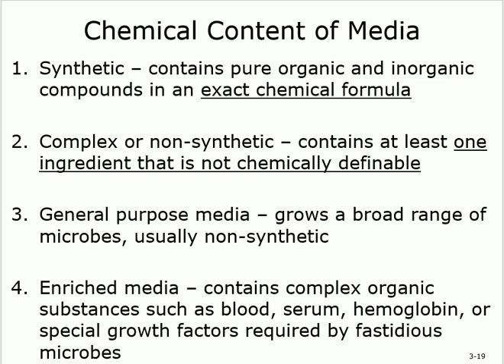And also, add to that, and we will see it, reproducible. So I can make 100 of those, I can make 1,000 of those. All of them are copies of each other. Is that clear for the synthetic one? Synthetic one, you know everything about it, and everything is exact numbers and reproducible. You can make a lot of these.